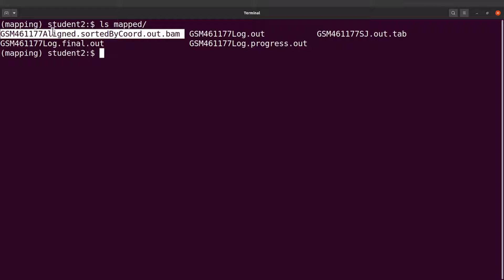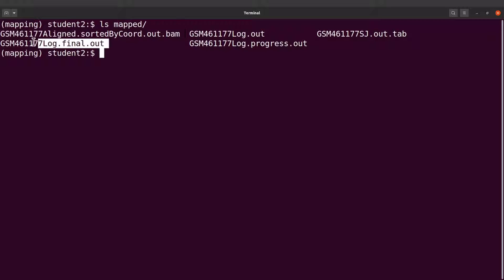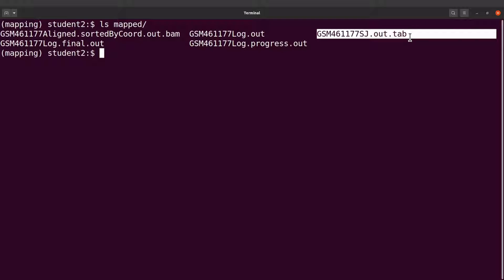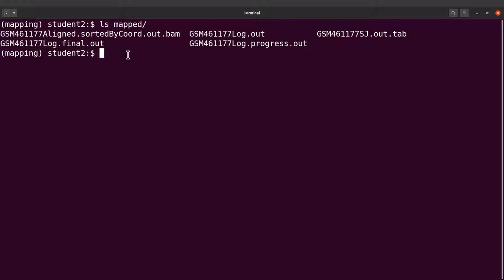This is the BAM file, it contains alignment records. We also have three log files here, and we also have this file which contains information about the reference sequence.